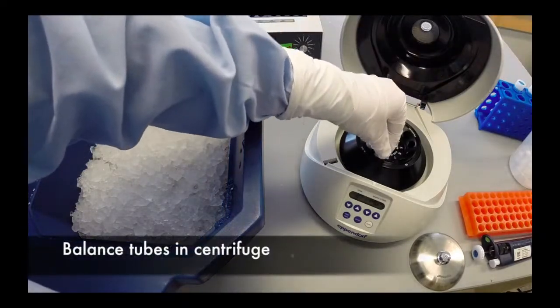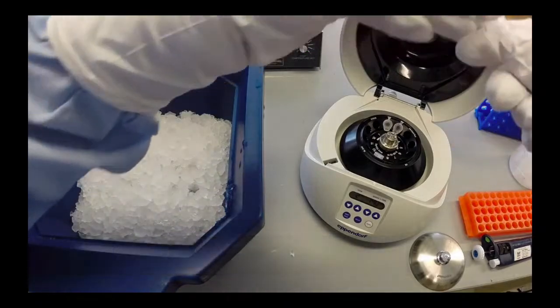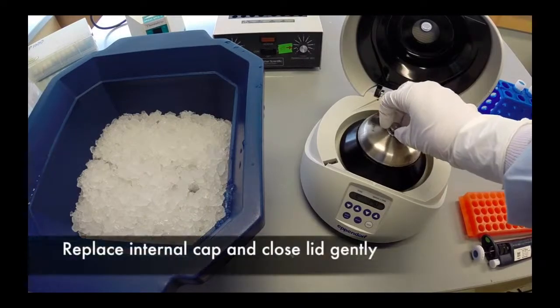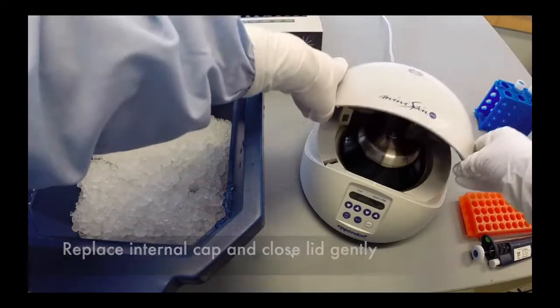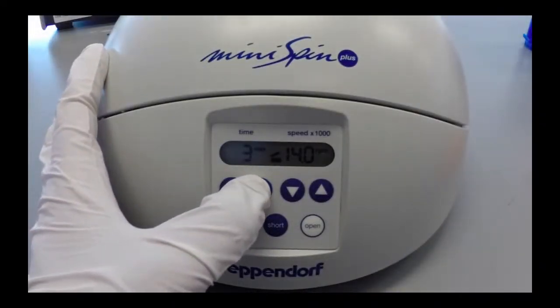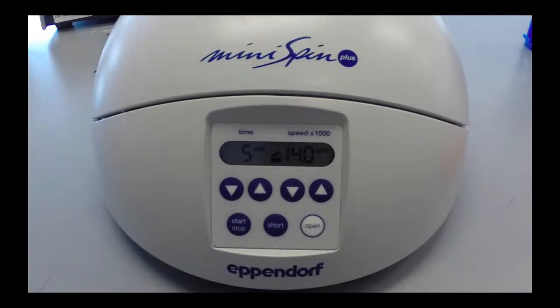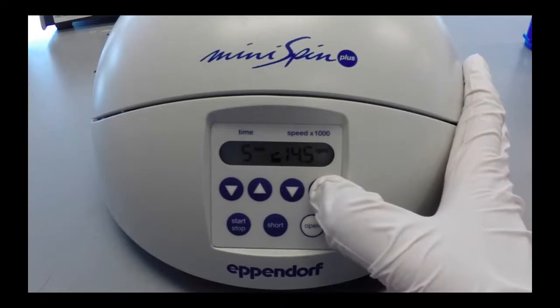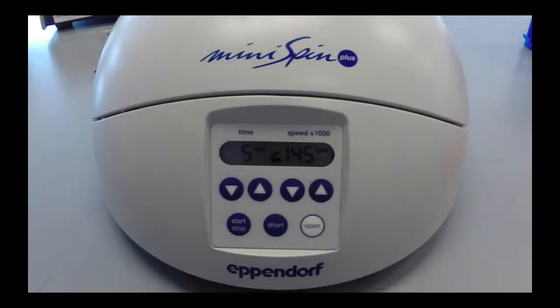And balance the tubes across the rotor by ensuring that all tubes have equal volumes. Replace the metal lid and press it until it clicks securely onto the rotor. Close the lid to the microcentrifuge gently. Change the centrifugation time by pressing the arrows to the desired time, in this case, 5 minutes. Press the arrows by the speed to navigate to the proper RPM. In this case, 14,500 RPM is the max this centrifuge can perform and is close enough to our desired speed.